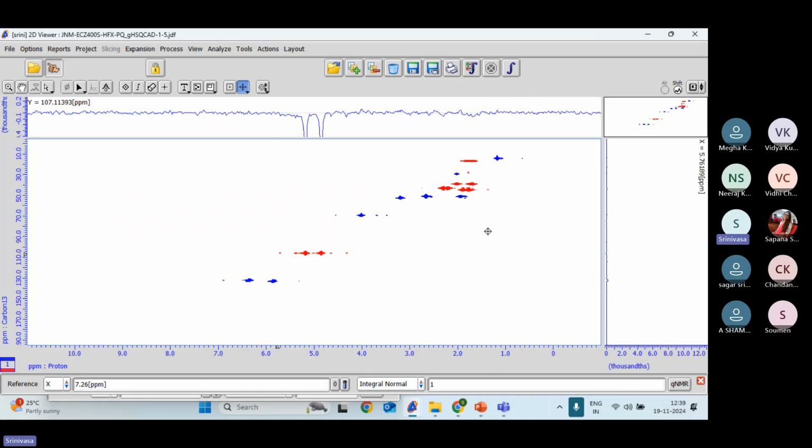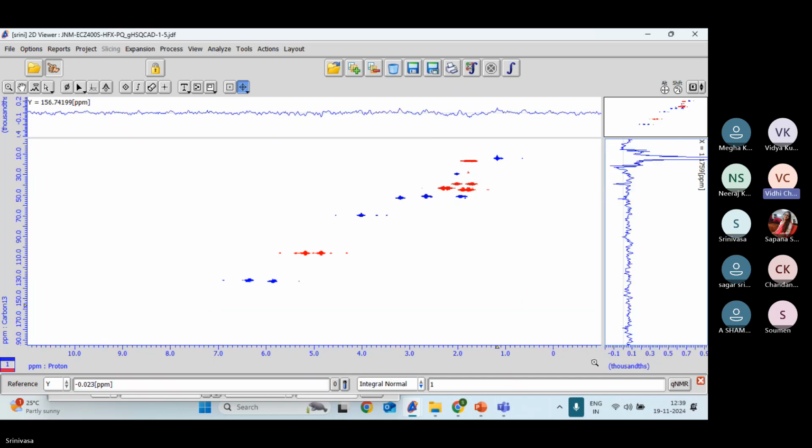Okay. Let me do the vertical now. Vertical means now you have to consider only a vertical peak, not the horizontal one. So please focus on the vertical line. My vertical line is touching this peak. Okay. So I'm just considering that. Now you can see the peak here. Can you show the base once again, how we will touch the vertical line while zooming the contour?